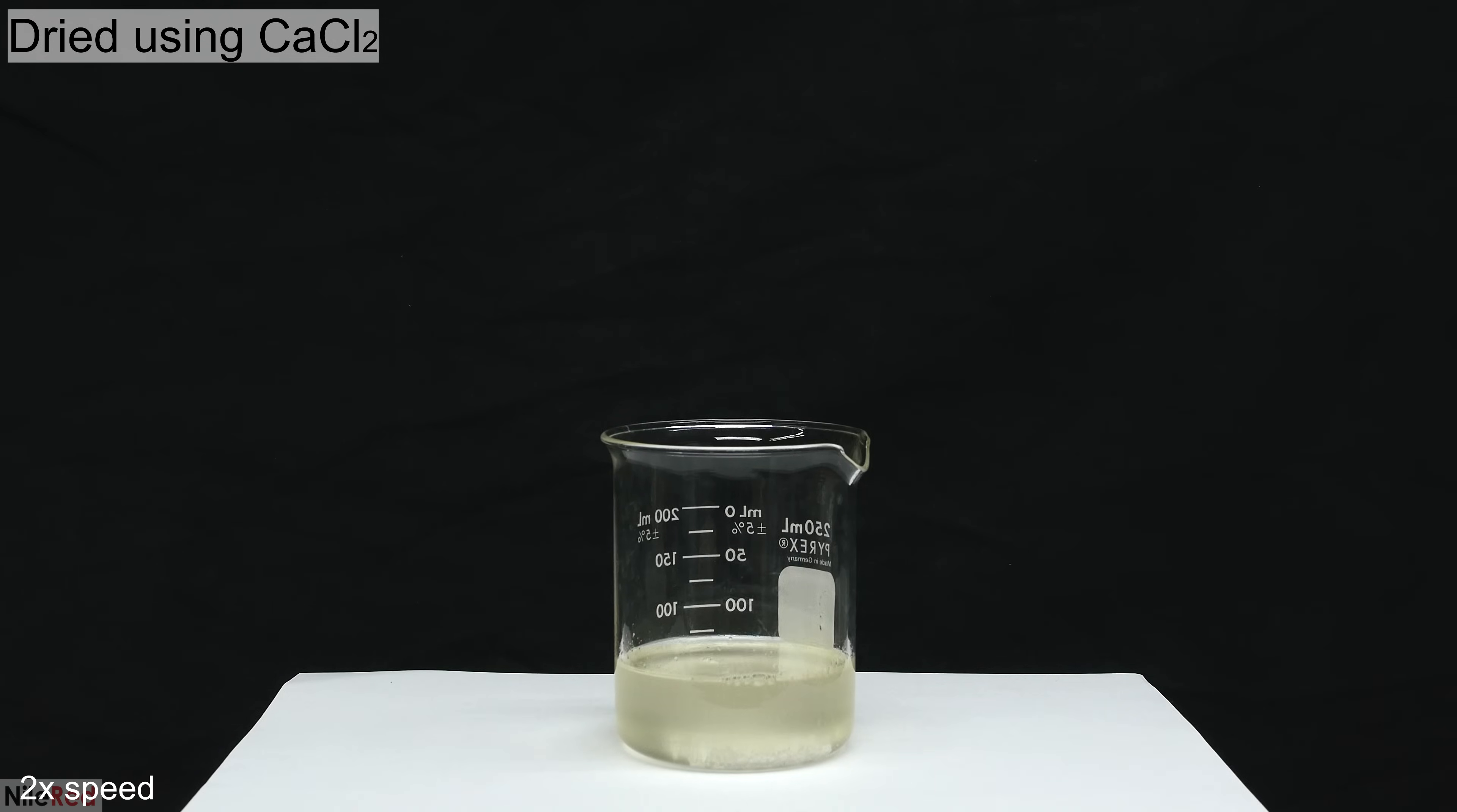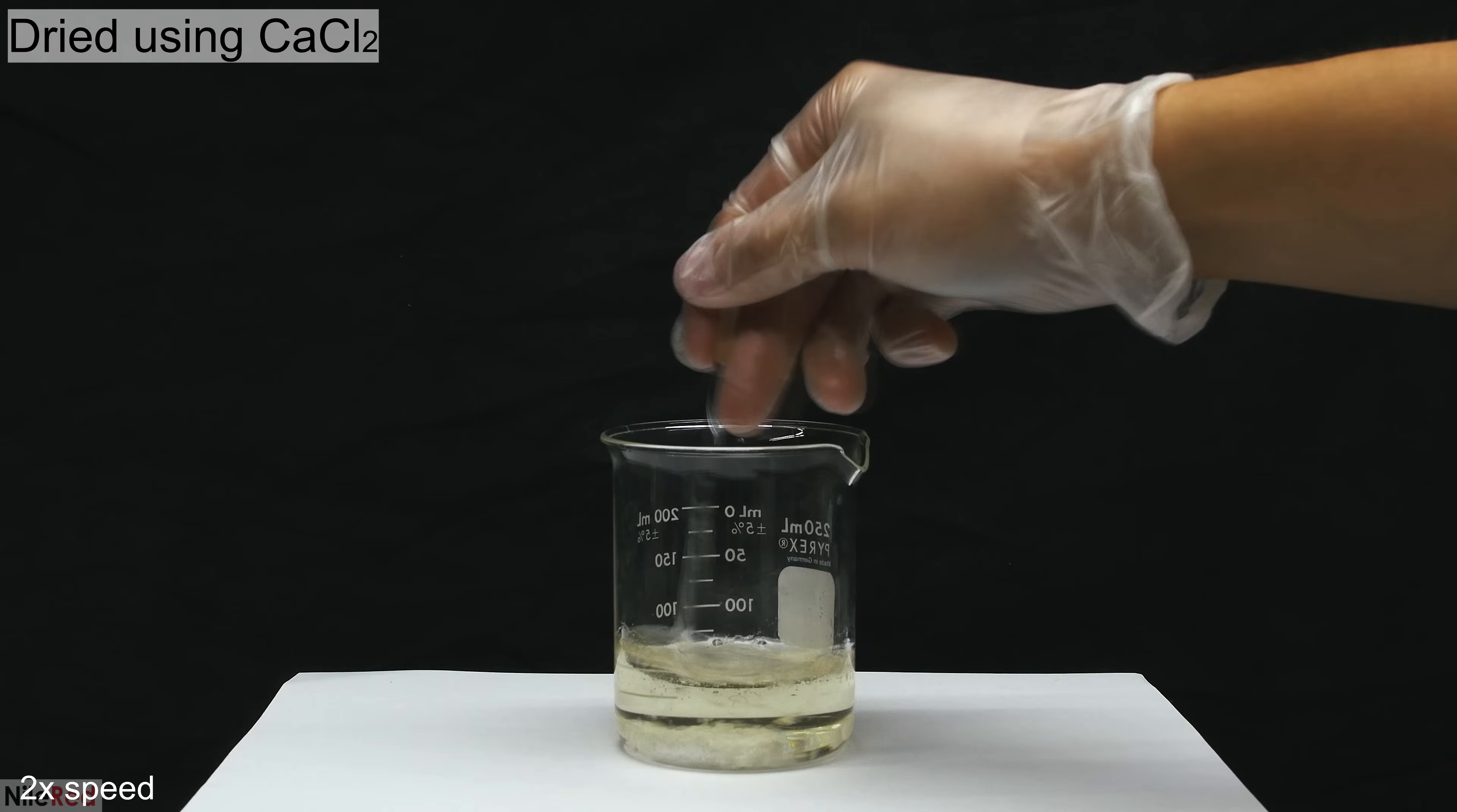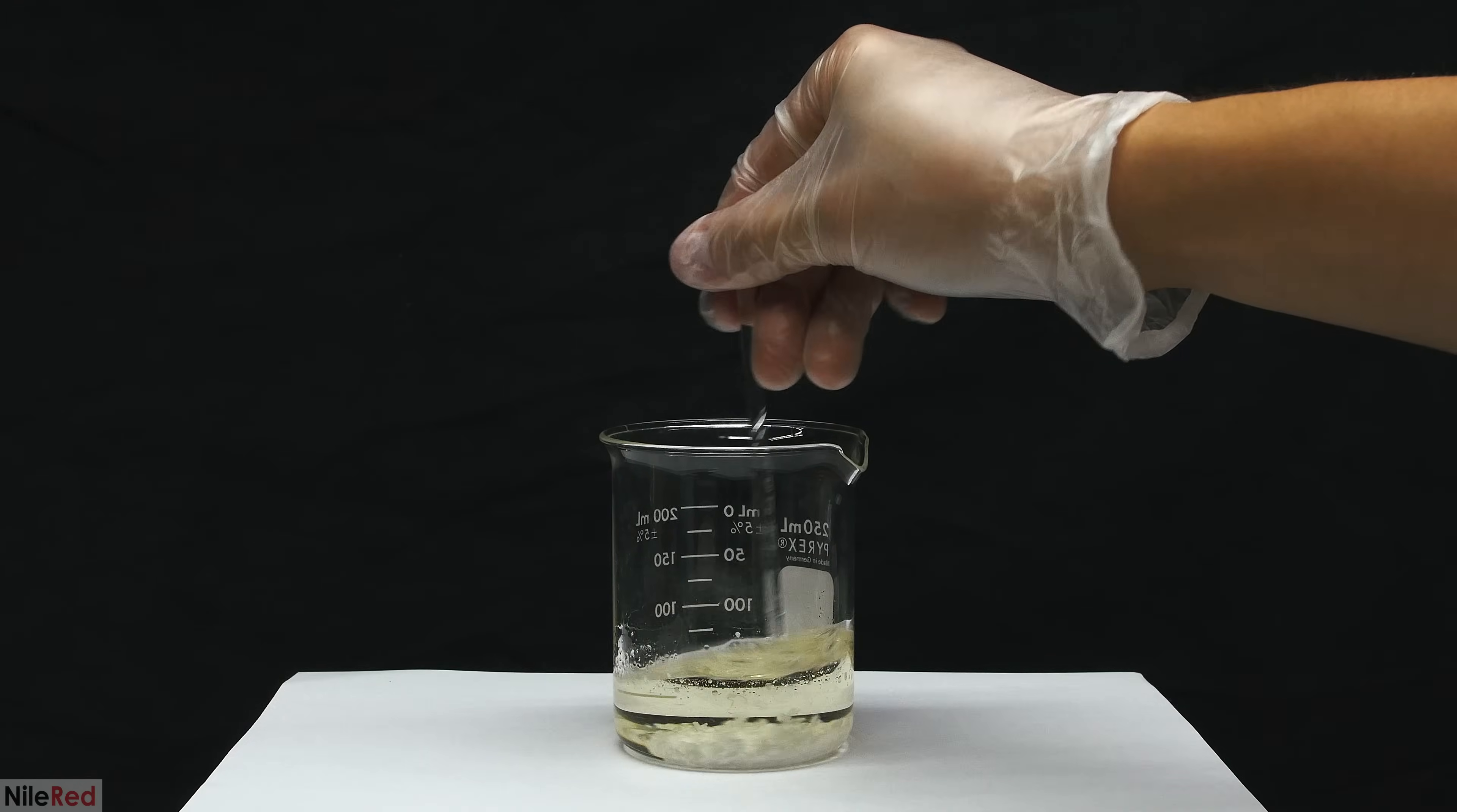In order to clear things up and to dry the DCM, we add in a little bit of calcium chloride. After mixing it around a little bit, we can see that the cloudiness slowly fades. I let it sit for something like 20 or 30 minutes, and when I come back, I'm left with a very clear solution.